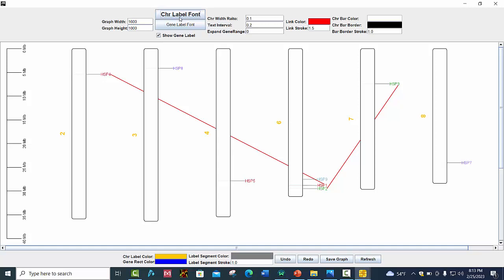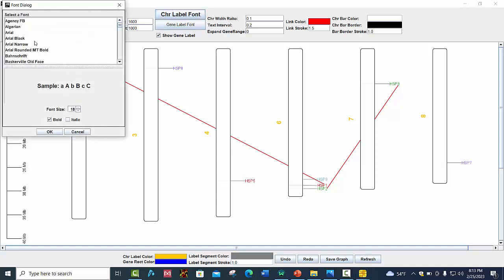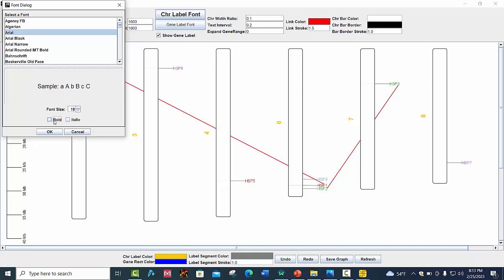By clicking on 'Chromosome Label Font' you can change the font. You can also change its font size, like selecting 20 or 80, and you can choose bold or italic.